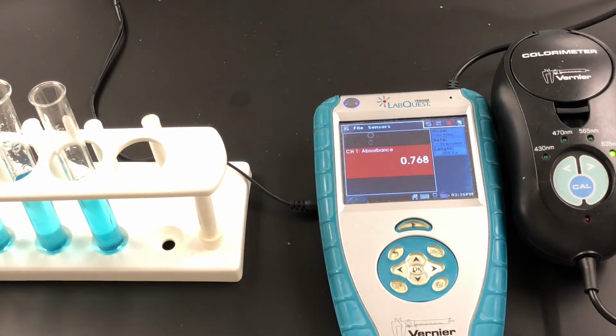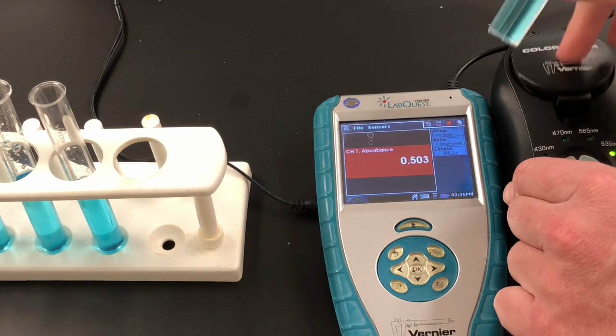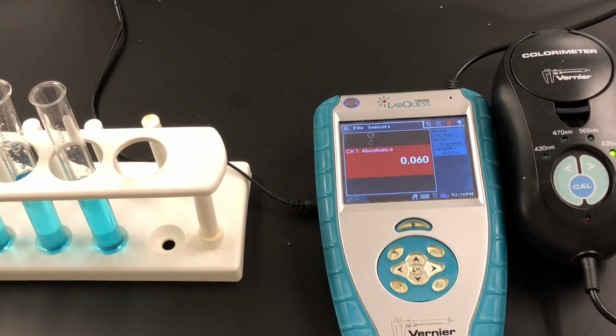Yeah, okay, so now our numbers look like they have a little bit better increment of change there, because we're expecting this to be a straight line, according to Beer's law. So we're going to go ahead and try our unknown now.